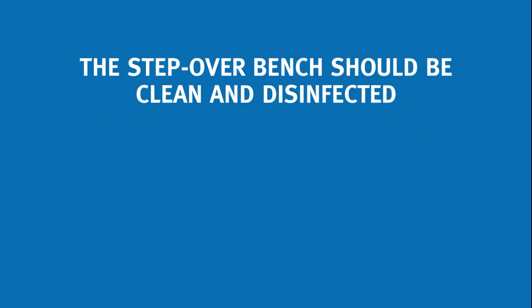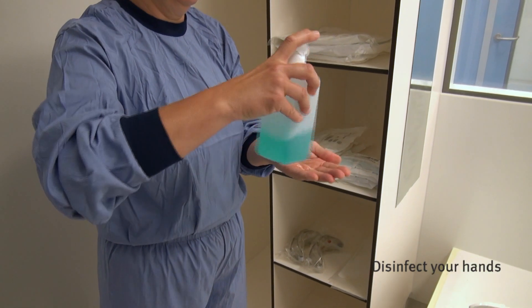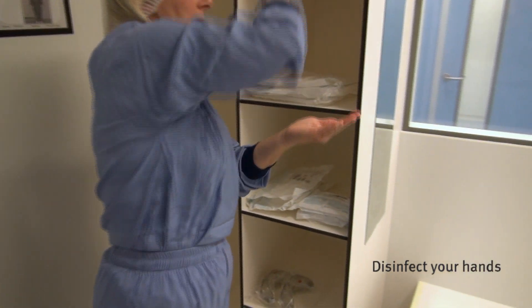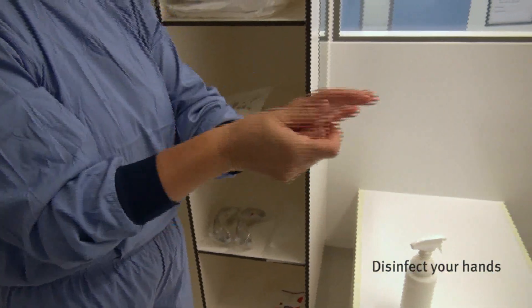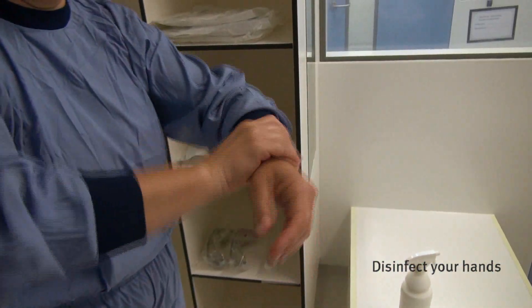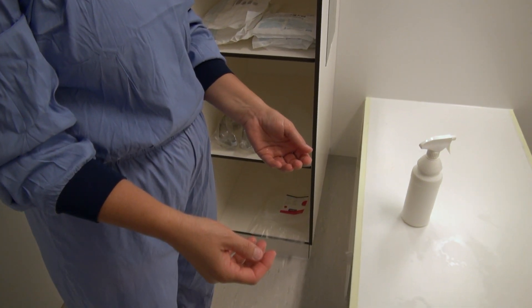The step-over bench should be clean and disinfected. Disinfect your hands before starting with the gowning procedure. Gently distribute the hand disinfectant over the whole surface of the hand, fingers and wrists. Don't rub your hands — rubbing will release skin flakes and microorganisms.